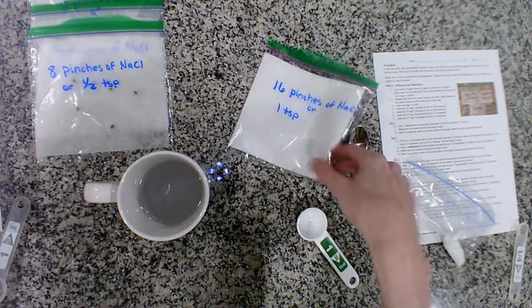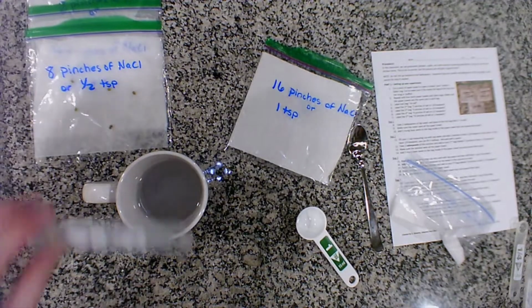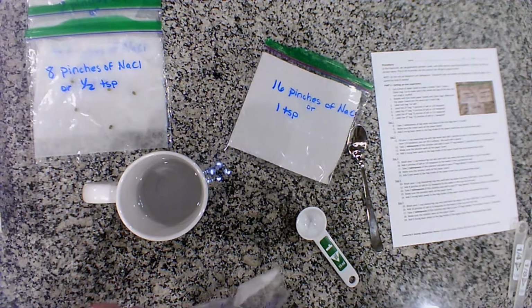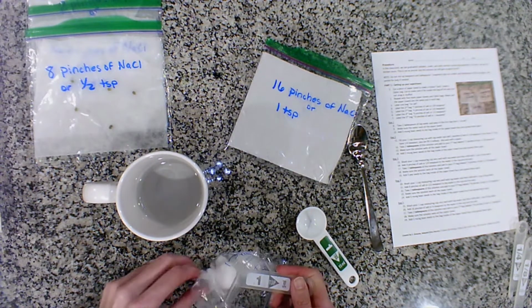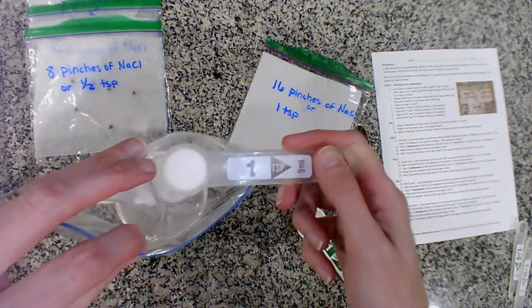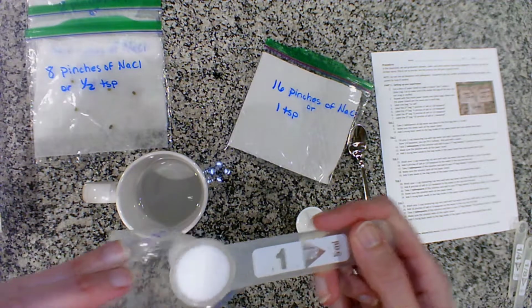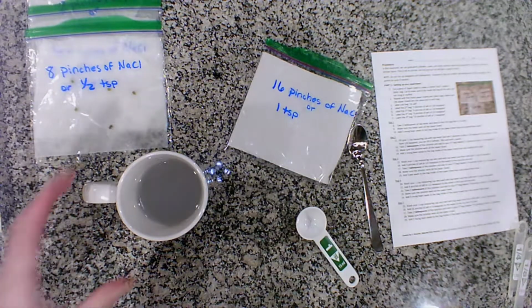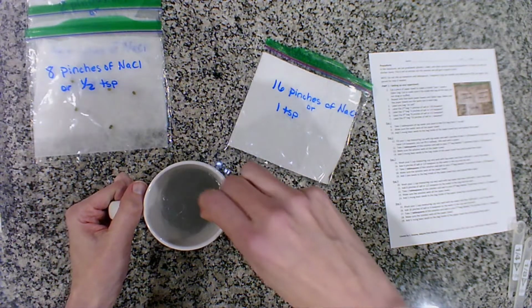All right. And this last one, hopefully you have a 1 teaspoon because 16 pinches is a lot, but you got to do what you got to do. So in this last one, I need 1 teaspoon. Sorry, a little shaky there. And I'm going to go ahead and drop it in there. I'll be done with all this stuff. Mix it really well. Oh yeah, it definitely looks much saltier.